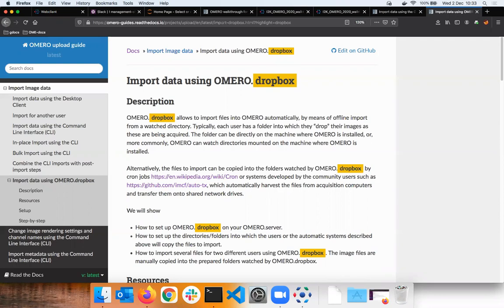Okay, and now you are blocked by the information bar. Exactly, you're blocked inside your institution by an internal information bar where there is the IT world and your world. This is not something which we can breach, of course, and that might also be the reason why we don't give out such solutions out of the box, because they are highly specific and they need the involvement from your side.